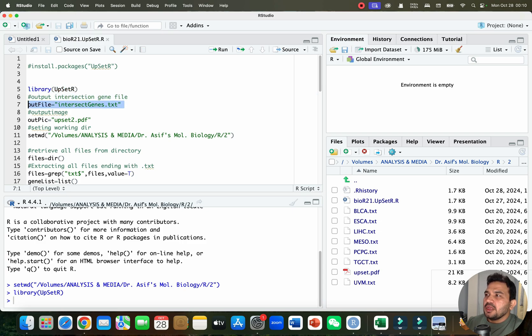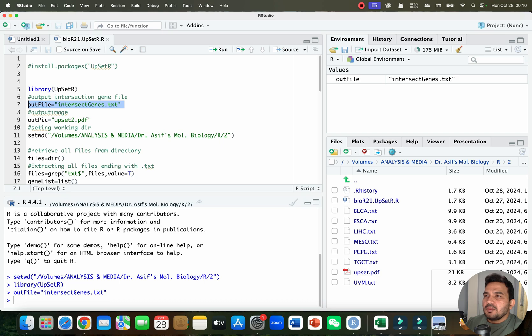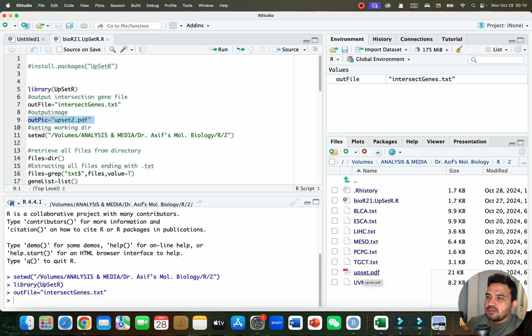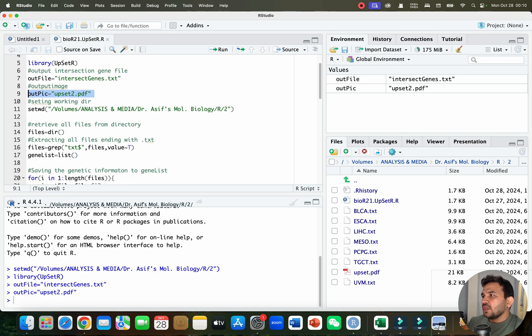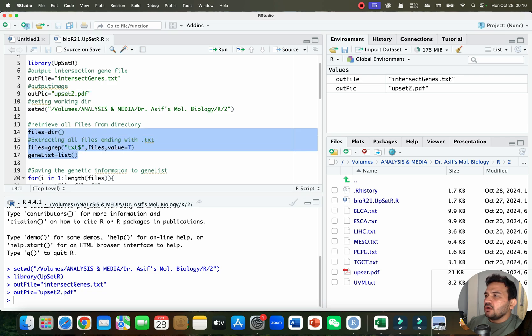Now we need to select our output file. The output file will be in the form of 'intersect_gene.txt'. I will run this, and we also want to export our image — you can see I already have a picture named 'upset', so I will save a new one as 'upset2.pdf'. I will simply run this. Since I have already set my working directory, I don't need to run that code again. Now we need to retrieve all files from this directory and extract all files ending with txt. I will select all this code and run it together — it will automatically select all files ending with txt.